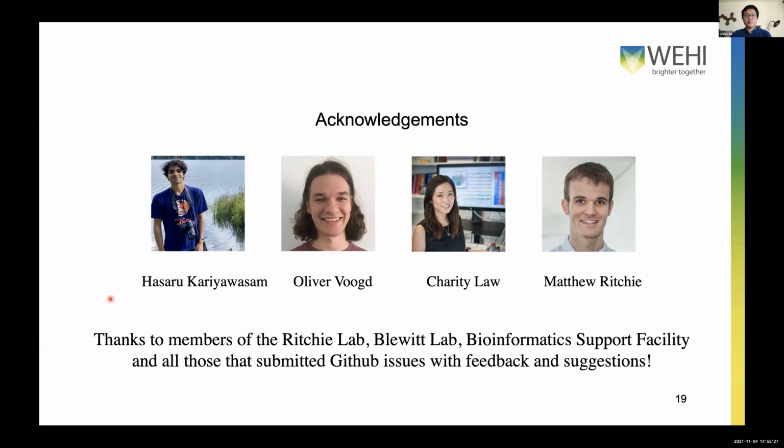Some of them I think didn't expose the interaction APIs that we wanted. And I think when we looked at quite a few of them, we found that Vega was just the best fit for what we wanted.